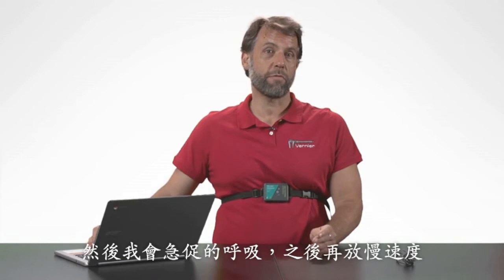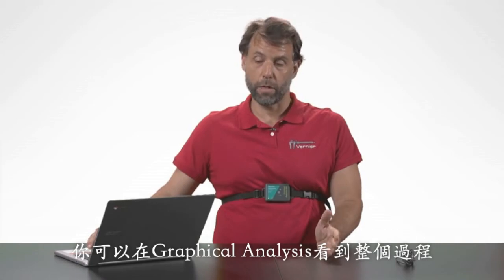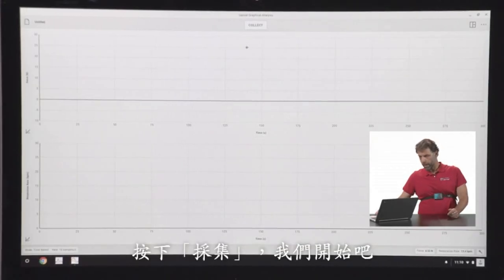What I'm going to do is breathe normally for a while, then breathe faster, and then slow down my breath rate. You should be able to see all of that in Graphical Analysis. So I'm going to hit collect, and let's get started.